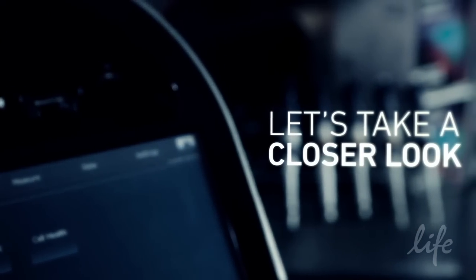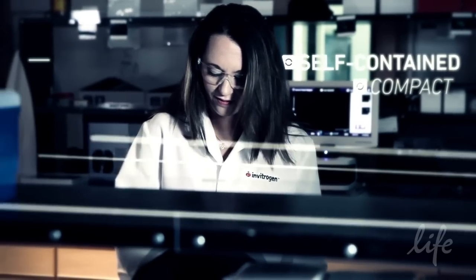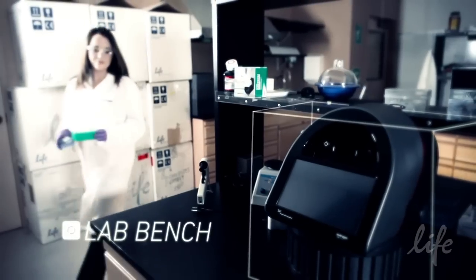Let's take a closer look. TALI is completely self-contained and compact enough to be placed in the cell culture hood or directly on your lab bench.